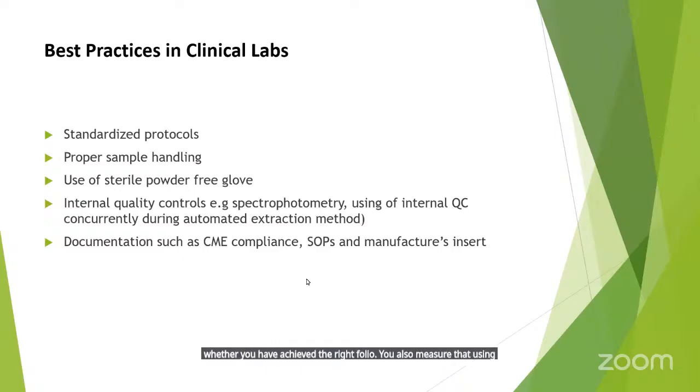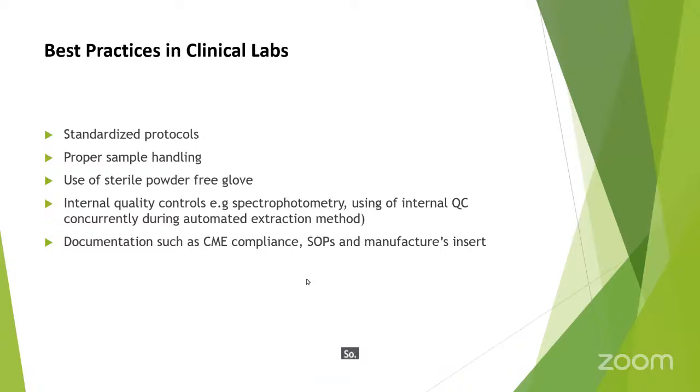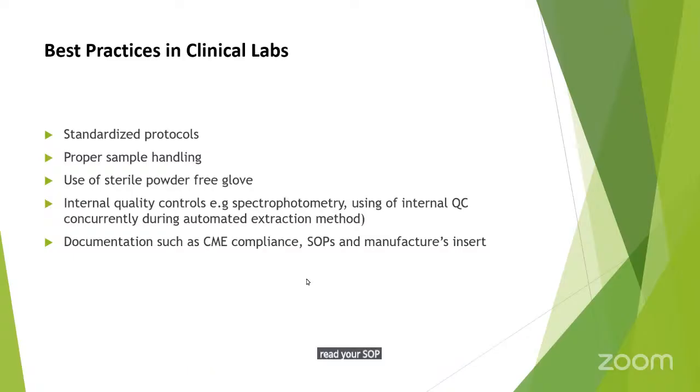You also need to use internal QC concurrently during automated or manual extraction methods. Also, for best practice, ensure documentation such as CME compliance. Read your SOPs properly and understand them. And if you are not sure of what you are doing, you can refer to the manufacturer insert.